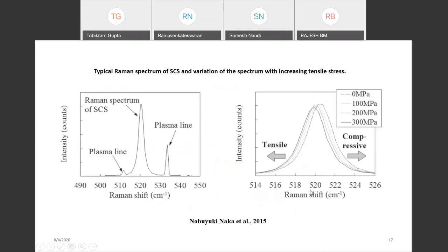The Raman spectrum can also be used to study tensile stress on the sample. In the Raman spectrum of the specimen in the absence of applied tensile stress, there are three major peaks: the strongest is located around 520 centimeter inverse, the typical Raman peak for single crystal silicon, while the other two correspond to plasma lines. Under tensile stress ranging from 0 to 300 megapascal, the peak position of single crystal silicon shifts towards the lower wavenumber side. Regardless of the magnitude of tensile stress, the shape of the spectrum remains symmetric and peak intensity does not change, indicating uniaxial tensile stress.